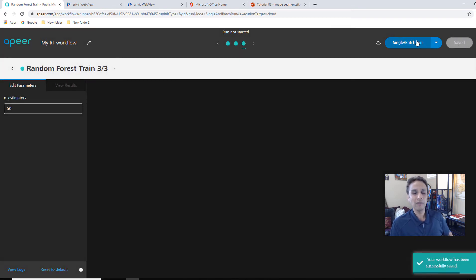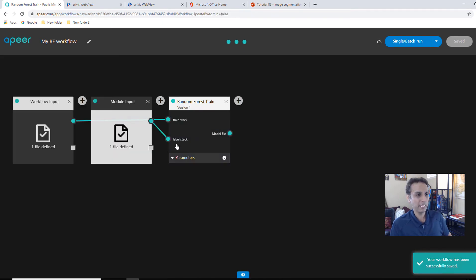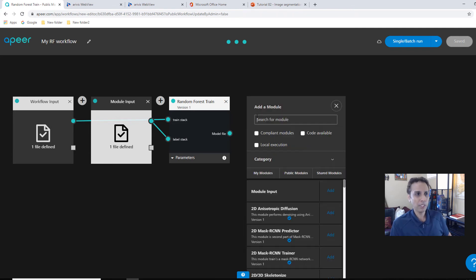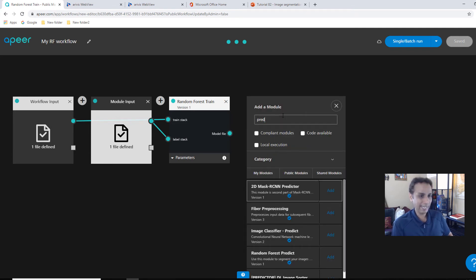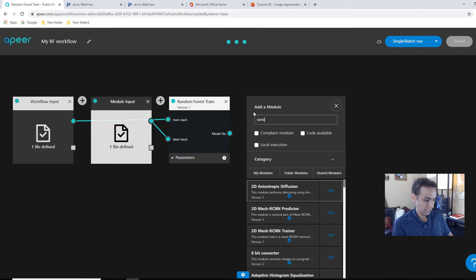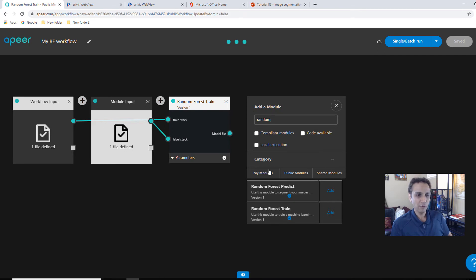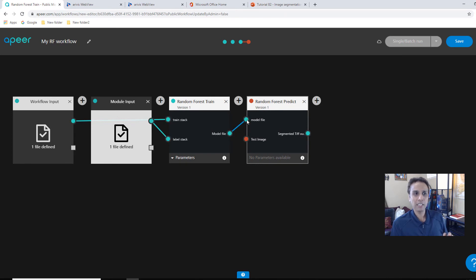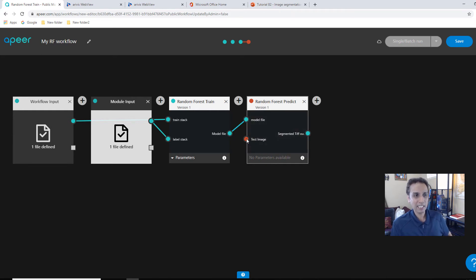Give it again, my RF workflow. Create now. When you do that, it gets added to your private collection of workflows. And now I'm modifying it by adding more stuff. So let's add an input module. Well, for now, let's add an input module in between these two. Module input. And this one goes as my label. So let's select the workflow input. Again, you can browse and upload it from your computer. Or you can, if you have your image link from Google Drive or something, you can provide it here. But because I've already uploaded this to APEER, let's go ahead and select this. So I'm going to select this, 3trainimages.tiff. And the second input is for my annotation. There you go.